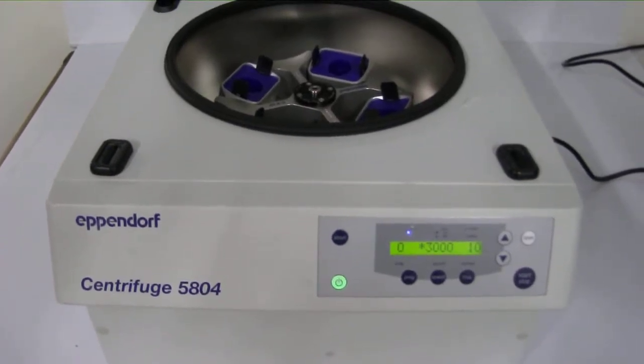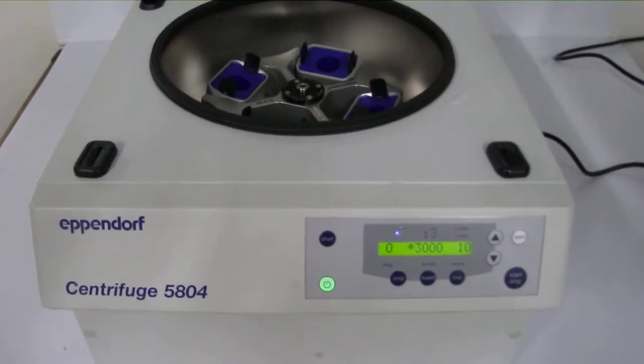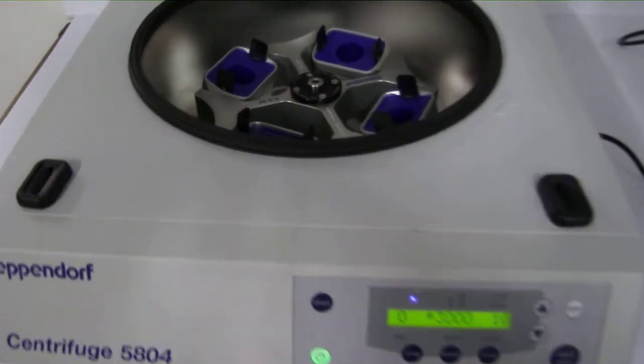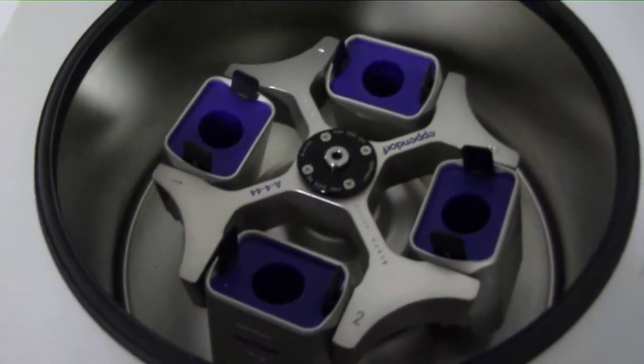Here we have the Eppendorf 5804 centrifuge. The Eppendorf 5804 is a high-speed centrifuge for medium capacity needs. It includes the A4-44 rotor and adapter inserts you see here.